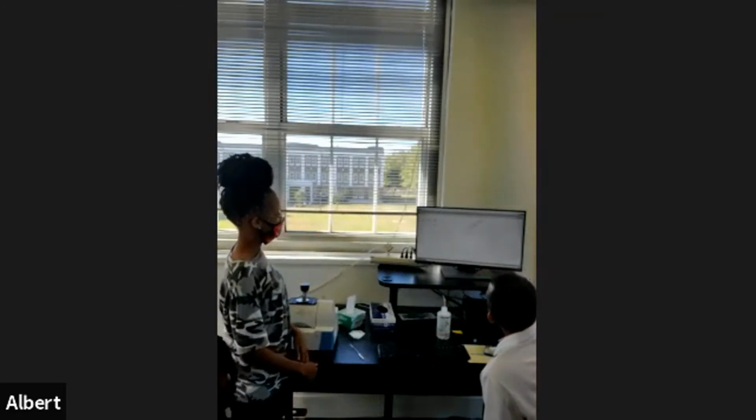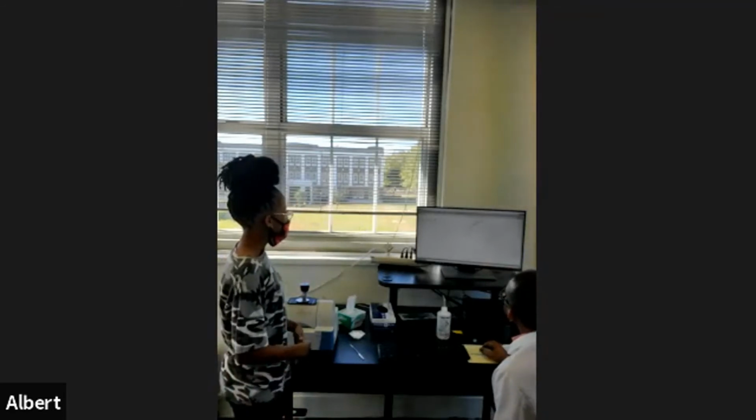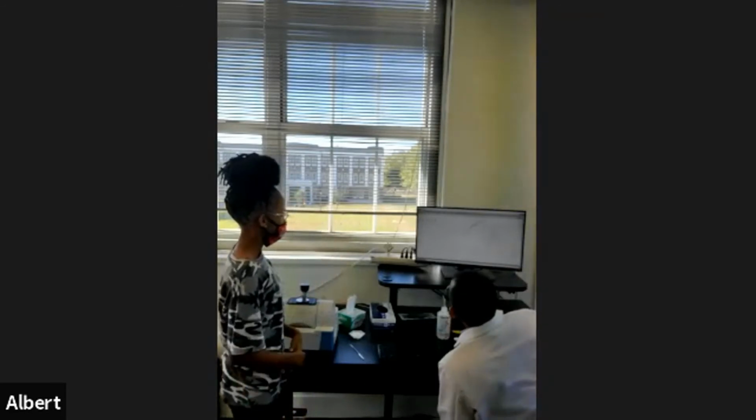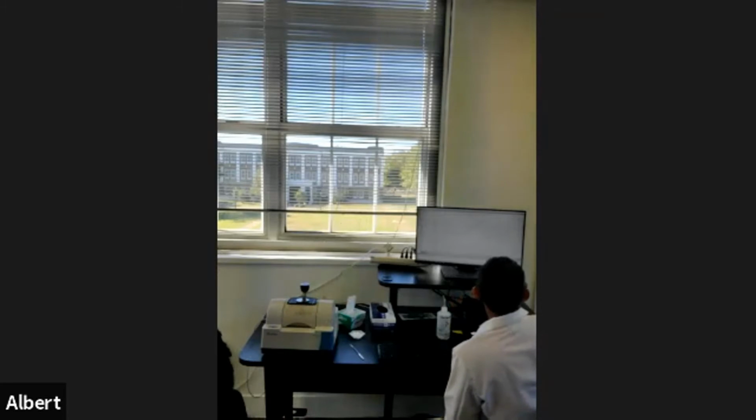It's pretty much very comparable. Kind of, yeah, more or less. The red one is sample number 3 compared to sample number 2. I can open it and see. Okay, here we can see the difference. The sample one is the red one. Normally, the sample that's open is going to be red. Big difference. Change the other ones in order for comparison. The green one is sample number 2, and the purple one is sample number 3.